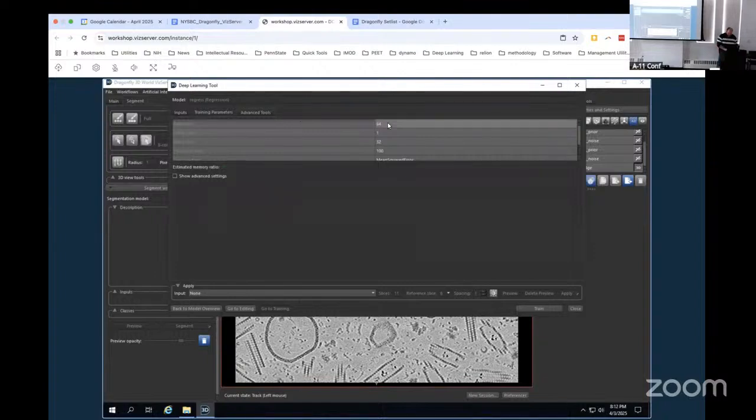And if you really want to train this, I would change it to 128. So you can use the synthetic data to train the denoising model? That's all I do. Okay, and then you can use that denoising model on your real data. Yes. Because this noise is synthetic noise, right? Yeah. It's been generated by the simulation. Yeah. And then turned it on as one of the options. Noise certainly came out of the reconstruction.